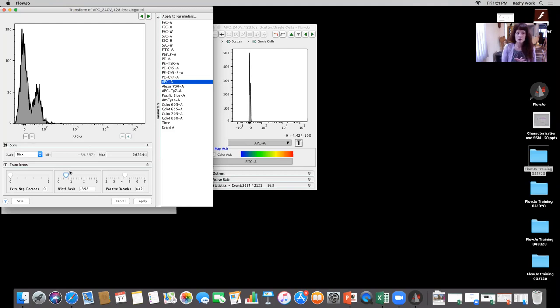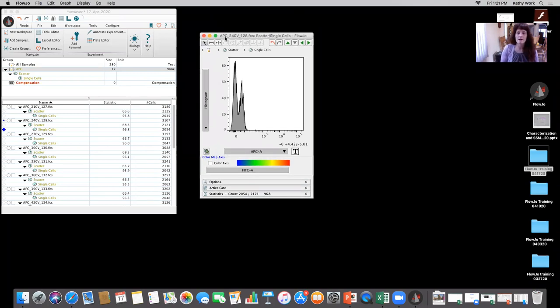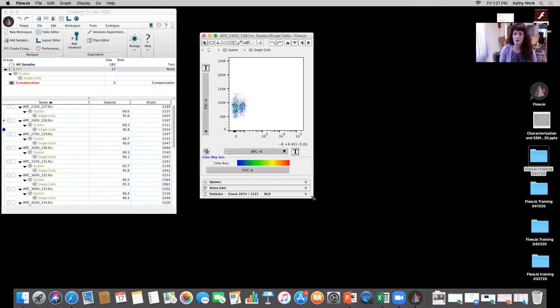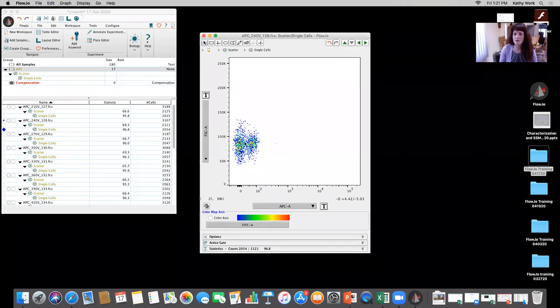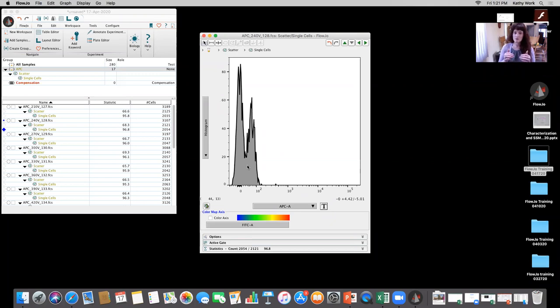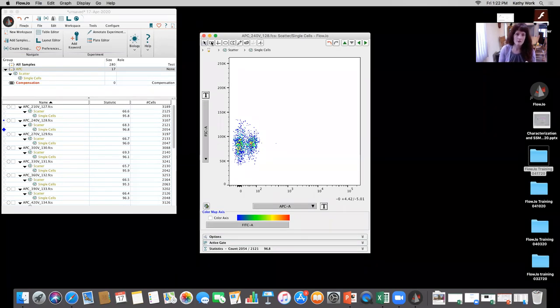On the X axis I choose APC and I can do a histogram. If I use the transform button and customize the axis, the width basis can be adjusted to reduce negative space so the two populations — negative and positive — become resolvable. Alternatively, I can look at it in a dot plot, which gives better resolution. When I go to a histogram, because it's univariate, we lose some resolution. Using forward scatter versus APC in a dot plot gives much better differentiation between the positive and negative populations.